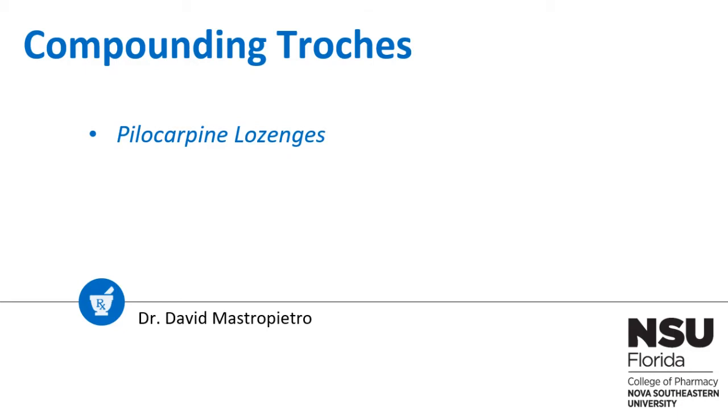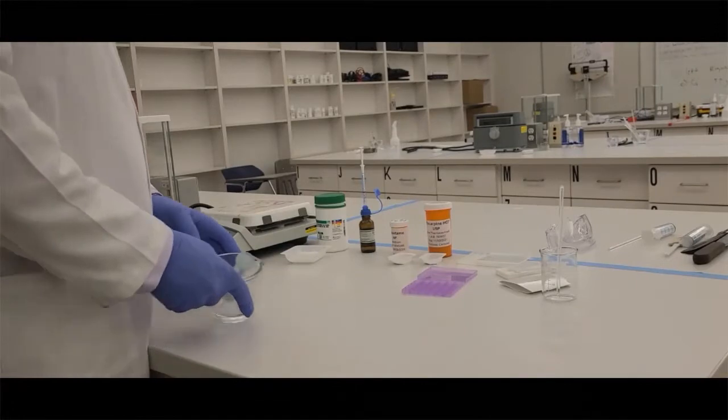This presentation is going to be for compounding troches, particularly the pilocarpine ones that we're doing in lab.